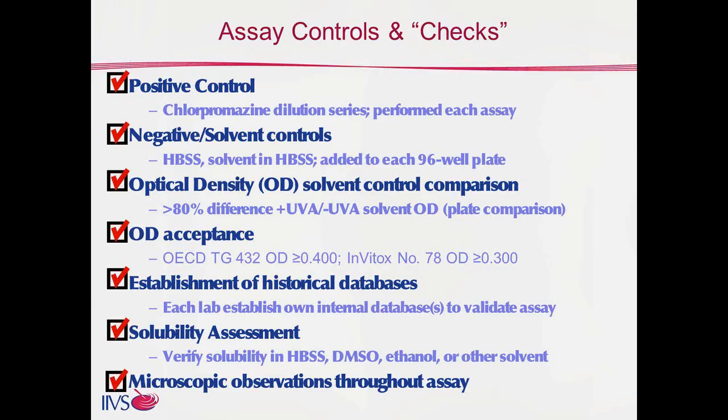Ideally, before your assay begins, you're going to assess the solubility of each test article. And then finally, since we can't see what's happening in our 96-well plates, we should be performing microscopic observations at defined steps throughout the assay.